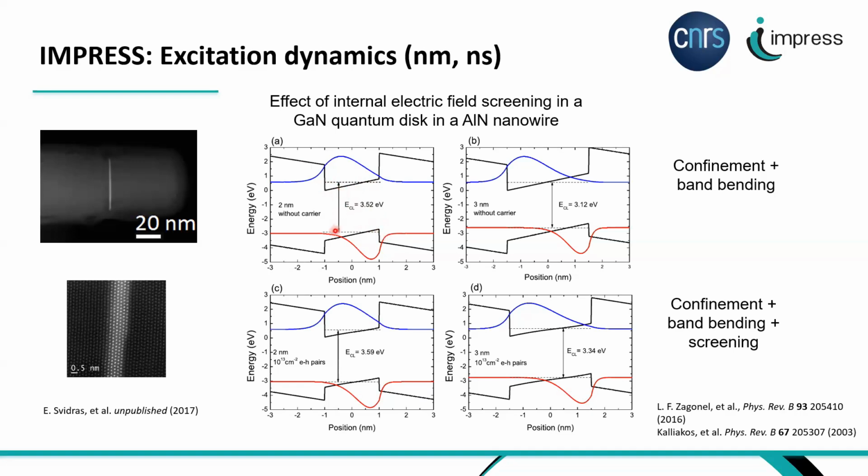So basically, the transition energy is smaller than the actual band gap of gallium nitride, or the expected quantum confined energy for gallium nitride. So this effect will depend on the width of the well. The larger the well, the stronger the quantum Stark effect. So if you have a larger well, you can have a significantly redshifted transition line.